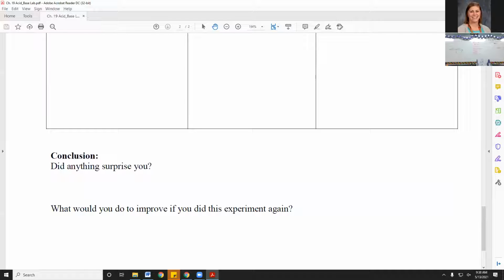Okay, so shoes are whatever. We're not going to wear goggles because these are all things that you can find in your house. We're not going to wear gloves because you're going to throw away all of the strips that you use. But since we'll be touching the containers, I would allow you to not wear gloves as long as everybody goes and washes their hands with soap and water before we start the lab. Does that sound like a good plan? If you feel like you really would like to wear gloves, I still have gloves, so you can wear them.